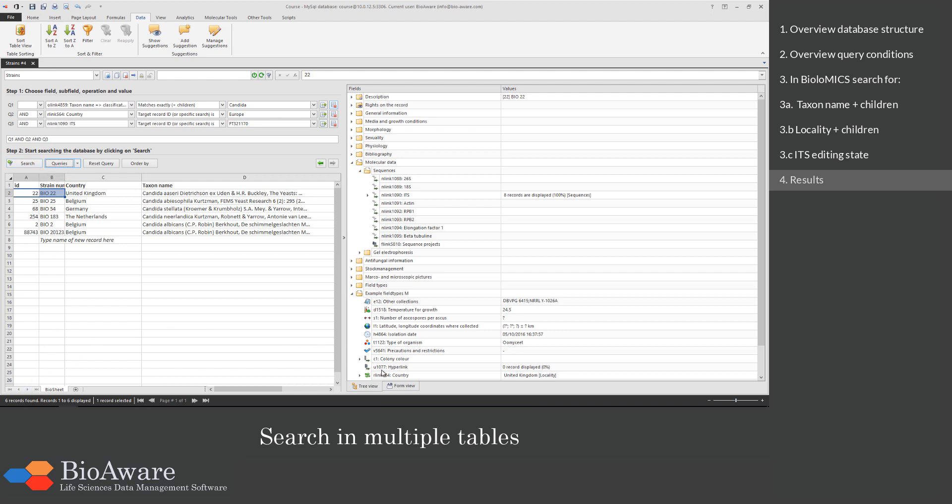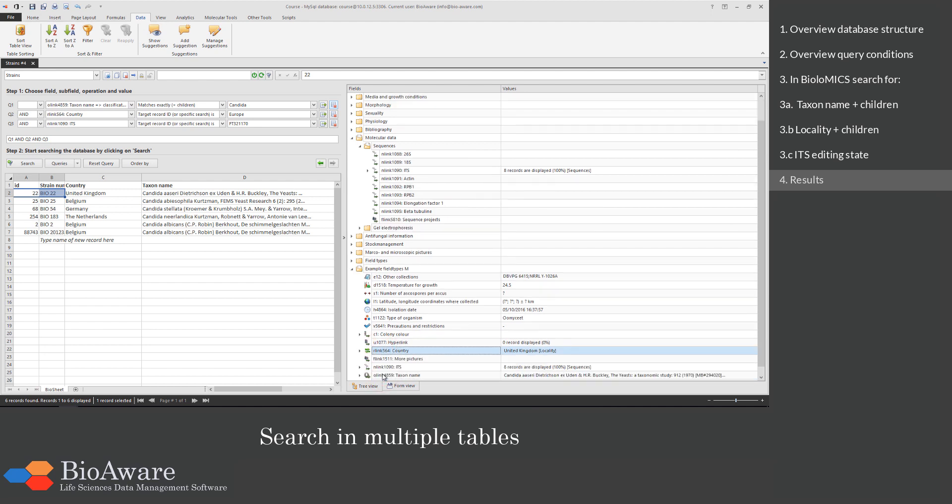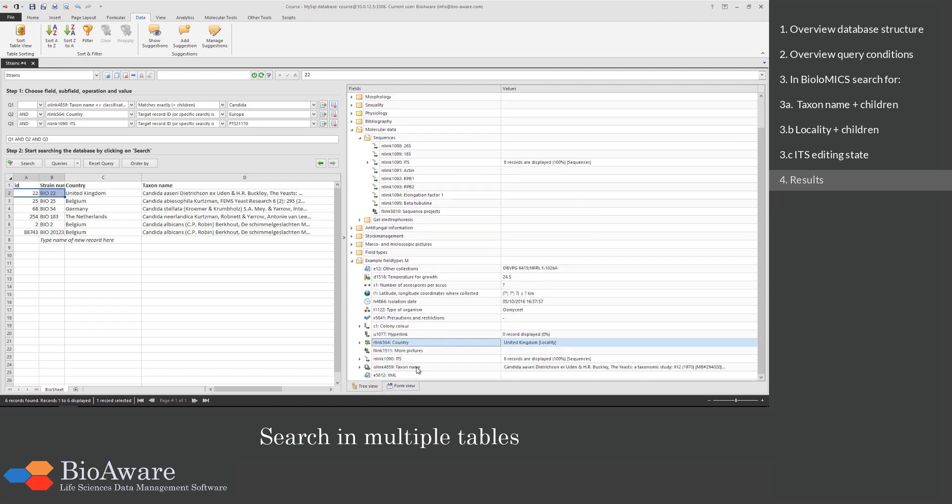The first one is selected and you see that the country is United Kingdom, which is in Europe. The taxon name is Candida aceri, which is part of the genus Candida.